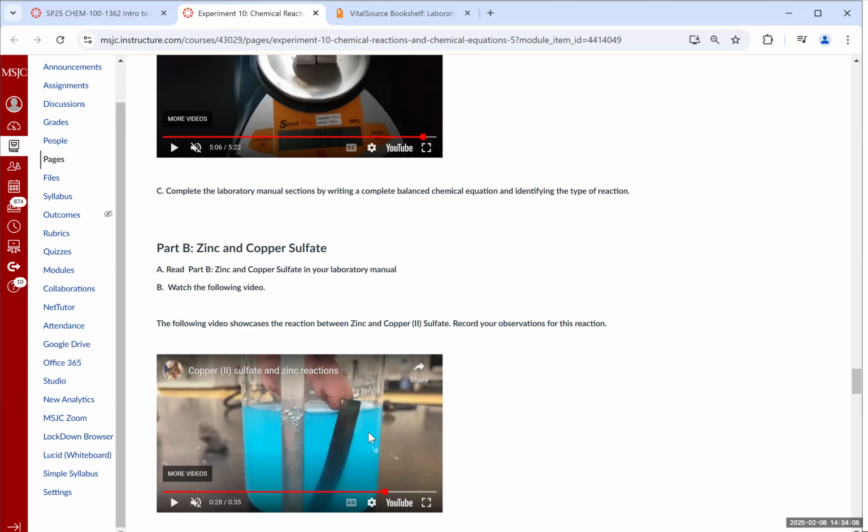As you notice, the zinc has changed color. Something has been deposited on the surface of the zinc. And in fact, if you were to take the dark sample on the right and scratch it, you'd be able to scratch off the layer that has been deposited on the zinc and reveal that on the inside you still have zinc that hasn't reacted. So what's leading to that dark color?